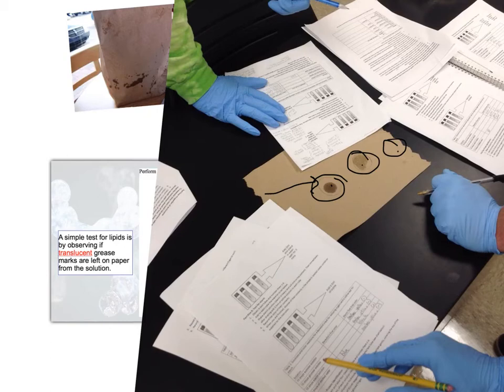Or you can just do this test first, and by the time you've finished with all your other tests, this test should be dry. And then you're going to hold it up to the light and see if you can see your hand or an object through it. If you can, that means it's translucent, so that would be positive. And if you can't, that probably means it's something like water, which would be negative. And that's going to be your last test.